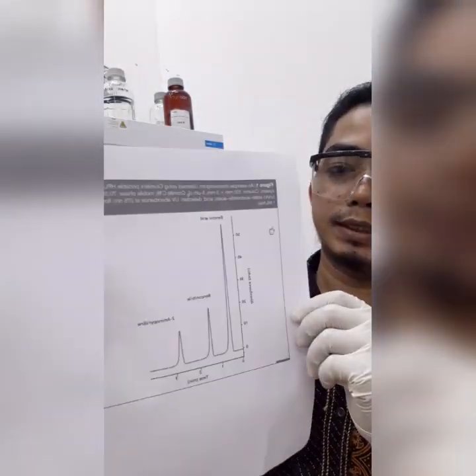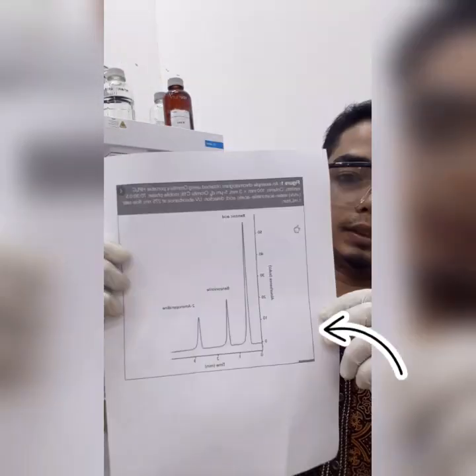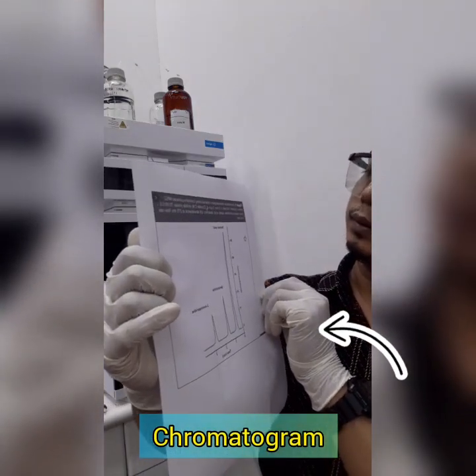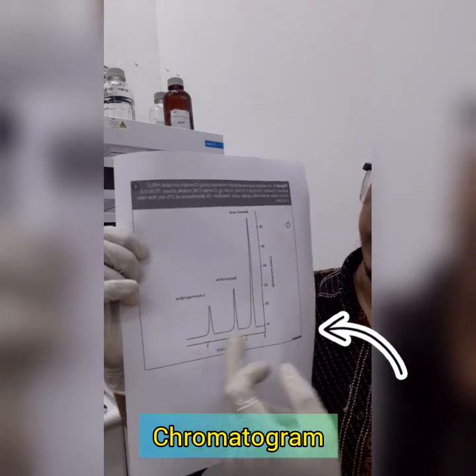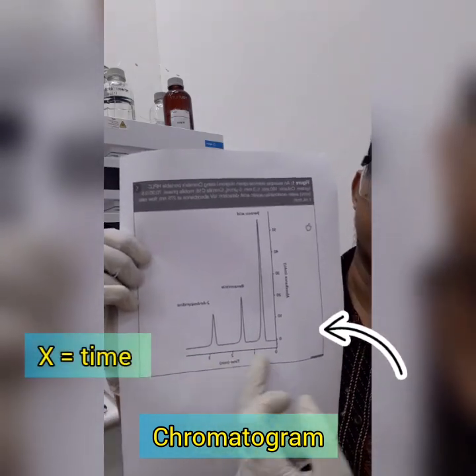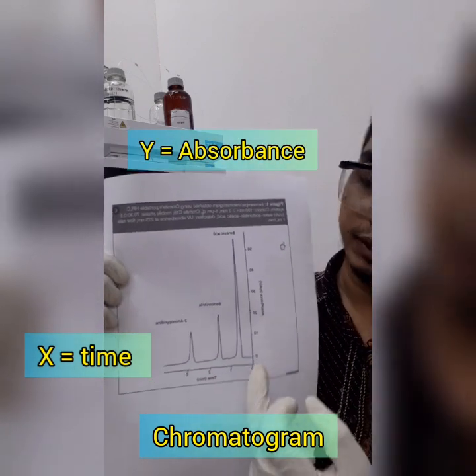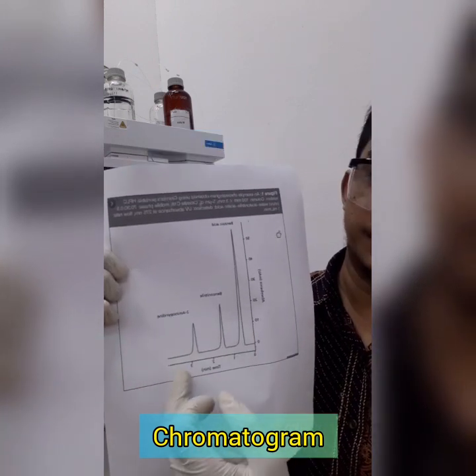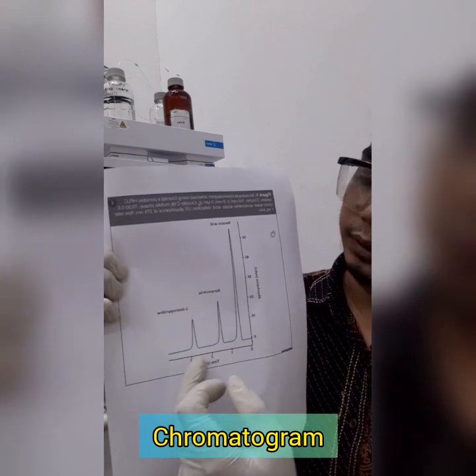Okay friends, this is one example of data analysis for HPLC. The X axis is time, retention time, and the Y axis is absorbance. This is the separation of the sample in the column, which can be displayed and collected in the data system.